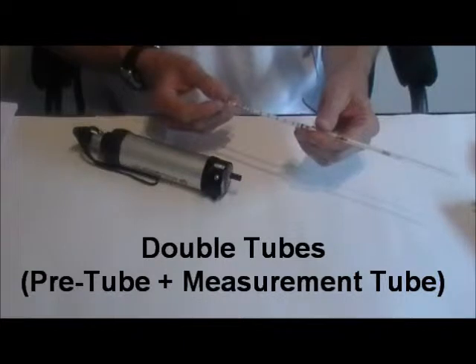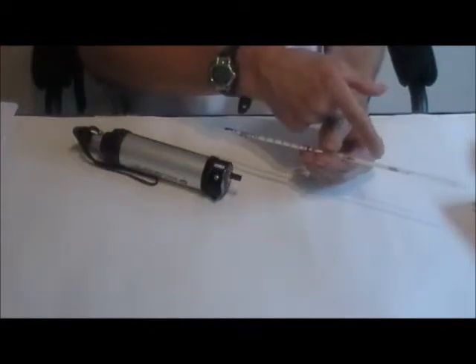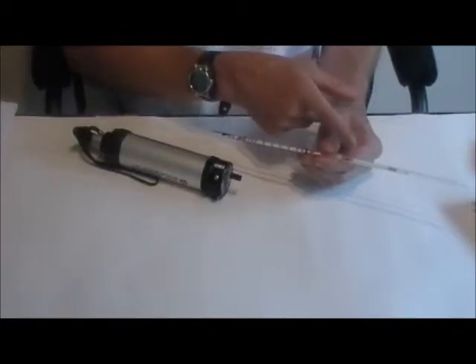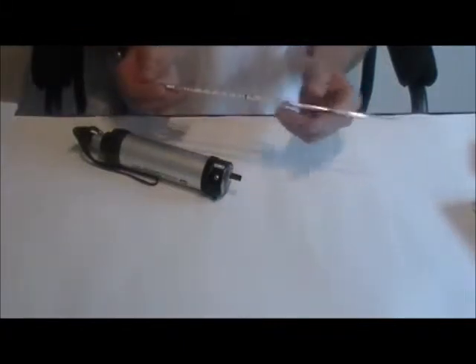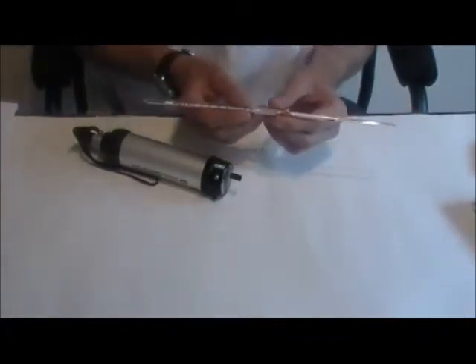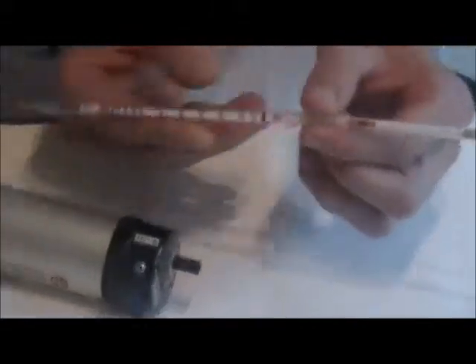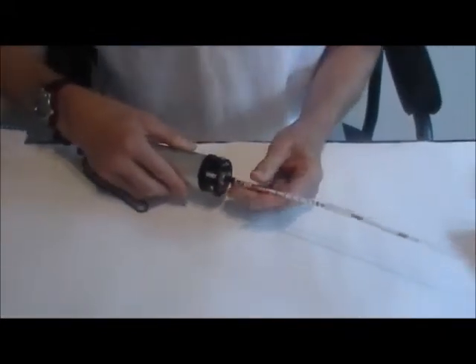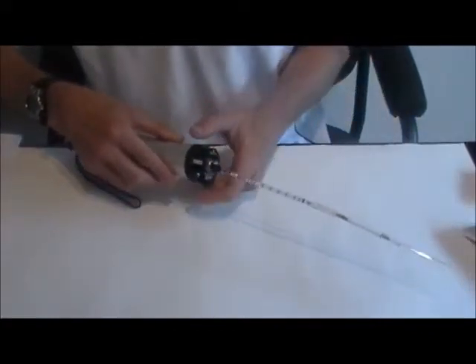Some tubes use a pre-tube in front of the measurement tube to pre-condition the gas. Pre-tubes are used for drying the gas, removing chemical interferences, or to convert the target compound into a form that is measurable in the measurement tube. To use a pre-tube, first break open all four ends of both tubes, then insert the ends with the two X's into the rubber connector. Making sure the arrow is pointing towards the pump, insert the measurement tube into the hand pump. The gas flow should enter the pre-tube first, then go through the measurement tube and into the hand pump.